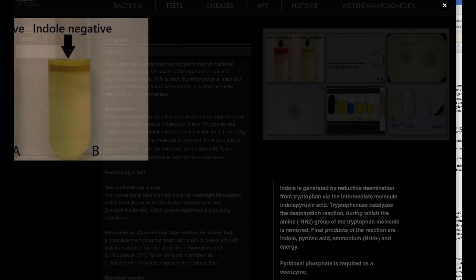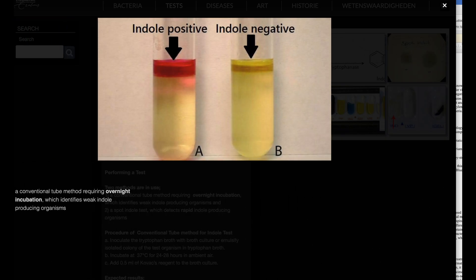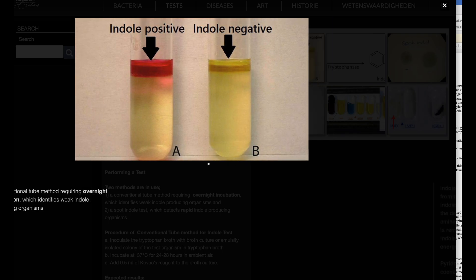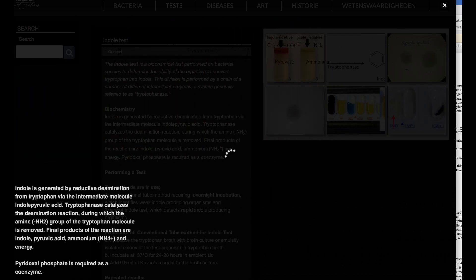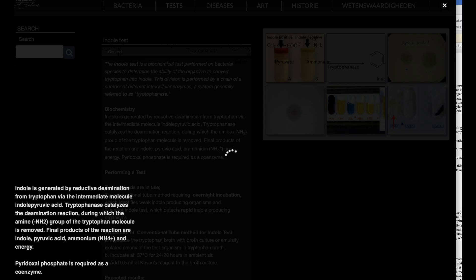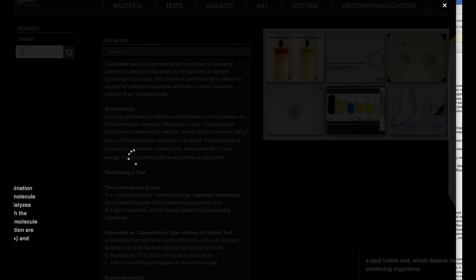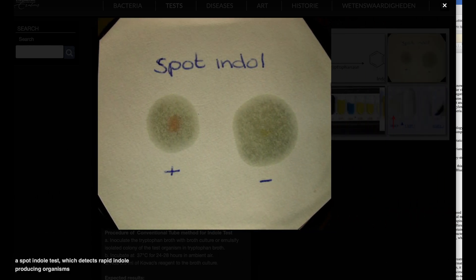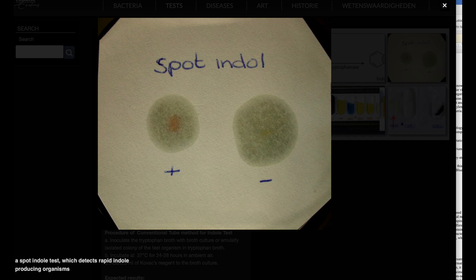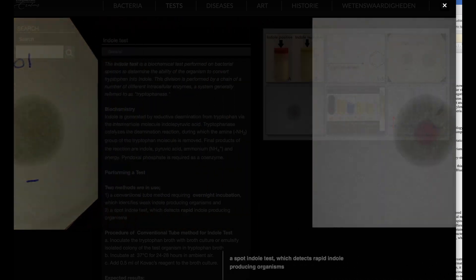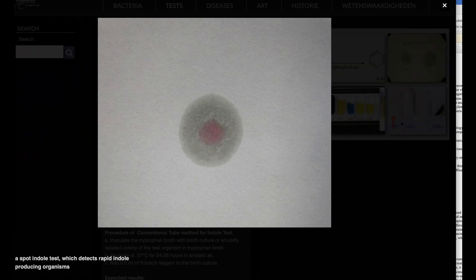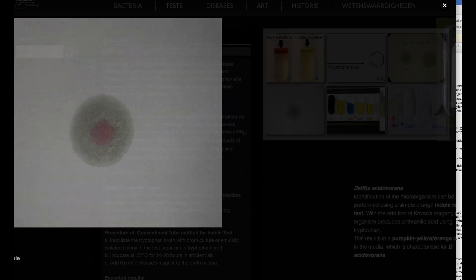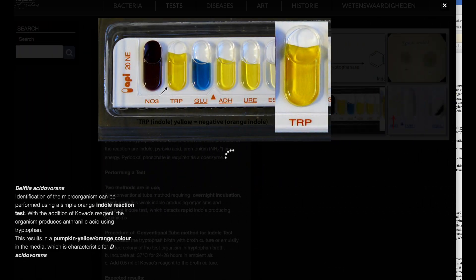Spot indole test procedure. Saturate a piece of filter paper with the 1% para-dimethylaminocinnamaldehyde reagent. Use a wooden stick or a loop to transfer a small portion of a bacterial colony from the agar surface to the filter paper. Note, avoid taking the inoculum from a MacConkey agar, as the color of lactose-fermenting colonies can interfere with test interpretation.